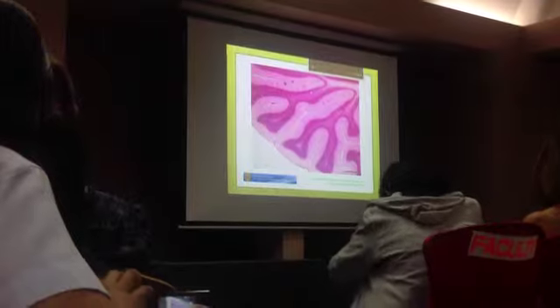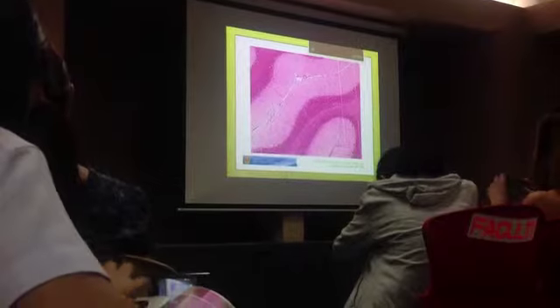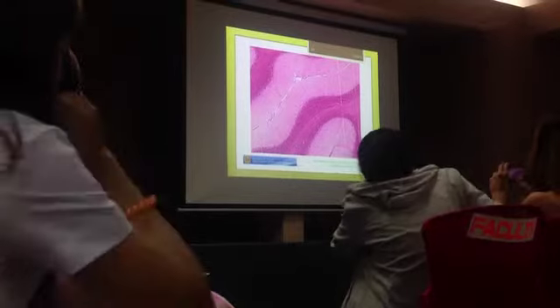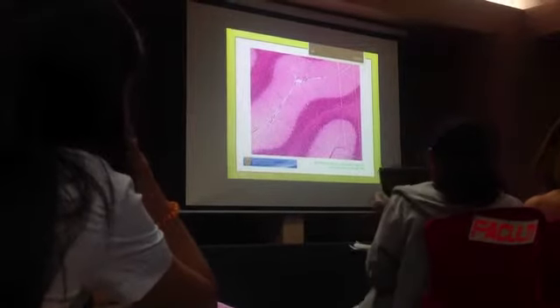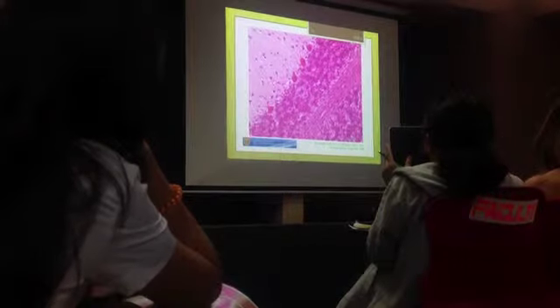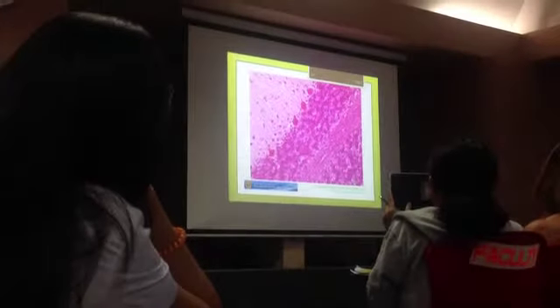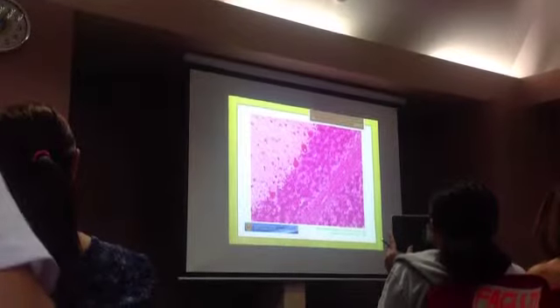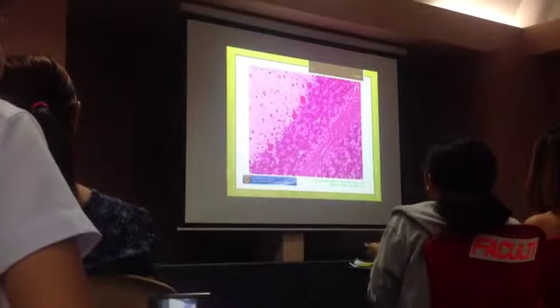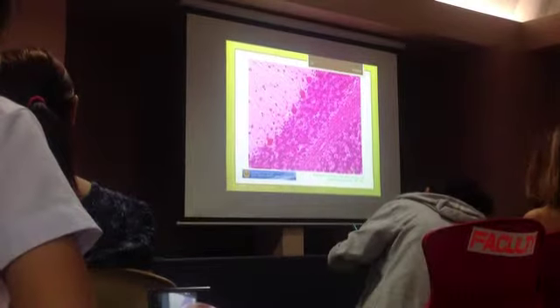This is also nervous tissue, and this is the cerebellar cortex. You have the molecular and granular layer. But between the molecular and granular layer, you are interested in these cells. Identify the cell: Purkinje cell. Classify according to the number of process: multipolar. You can see clearly.